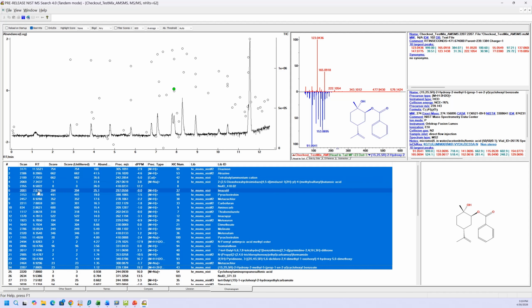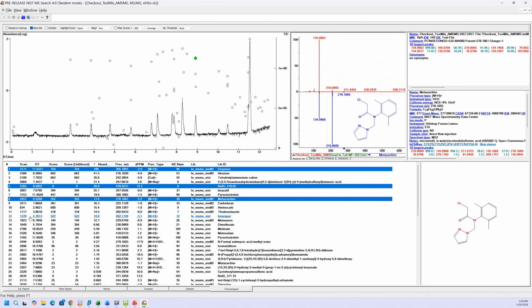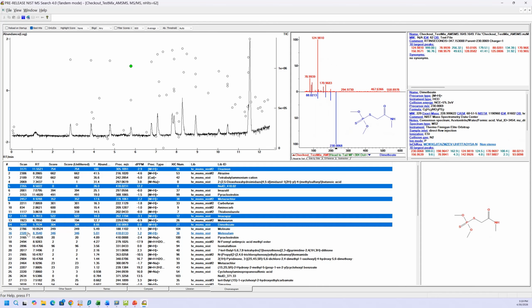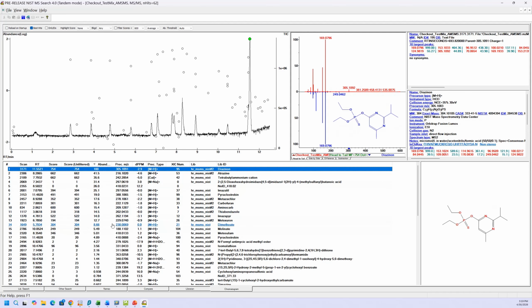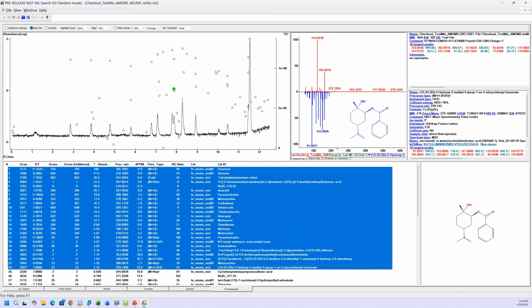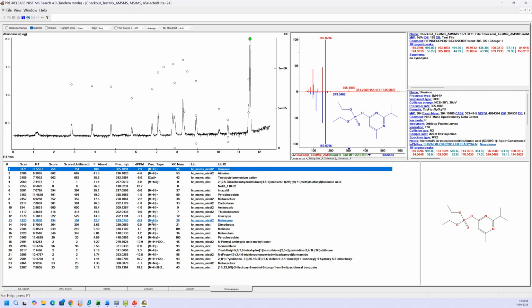You can also select with the control key by selecting one at a time. So you don't have to select all that are continuous, back to back to each other. So there's lots of different ways, but I tend to use the shift key the most. And let's just pick everything that has an abundance above about 1%. And now I just want to make this less complex up there. So I'll just say show, and I'll say show selected. And you now have only those shown. So you're just getting the big things that way.